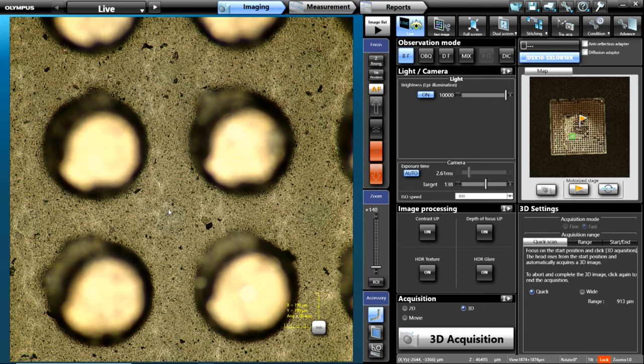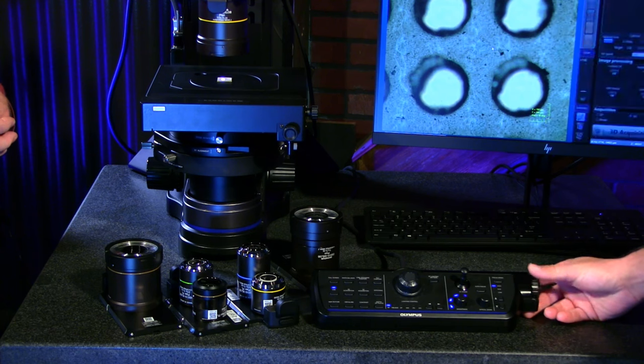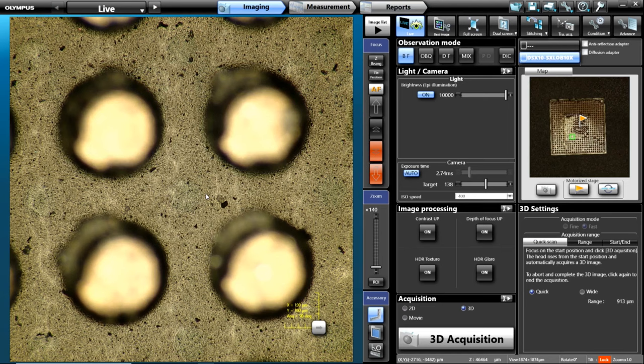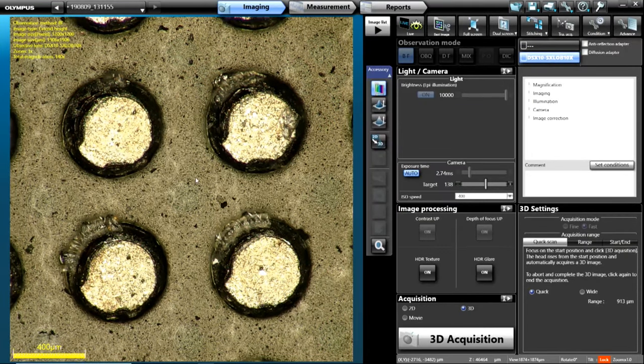Now that we're at 10x and we have these four pins, maybe we want to see these pins in focus at the top and the bottom at the same time. That's a great possibility since we're controlling motorized Z. All we have to do is hit the 3D acquisition button on the hand switch or in the software, and it's going to scan through and quickly grab all of our focus information. It steps through Z, taking a shot each time, and then stacks them all up. It's almost instant — if you blinked, you would have missed it.